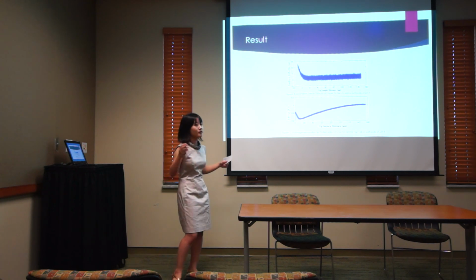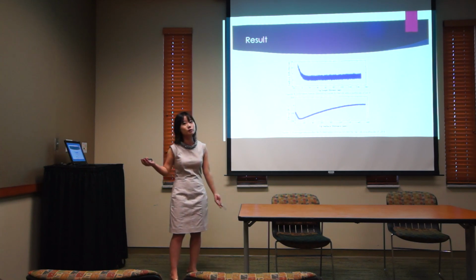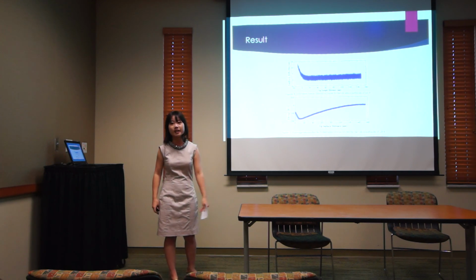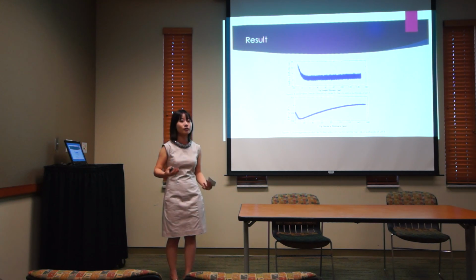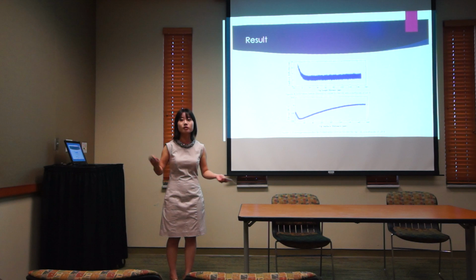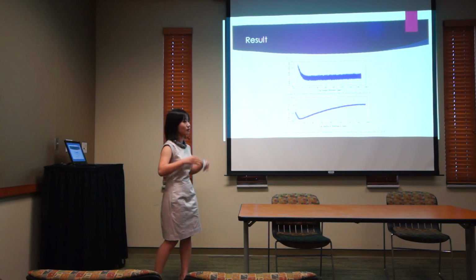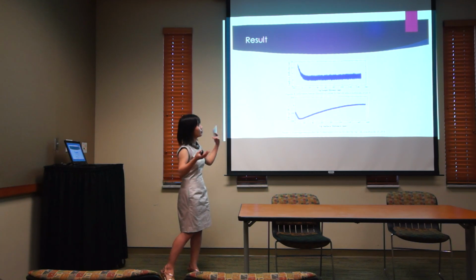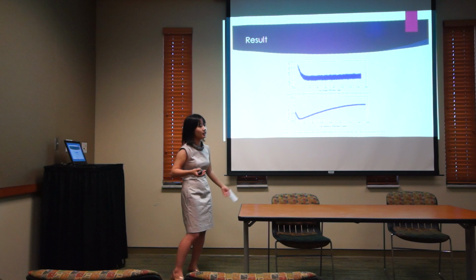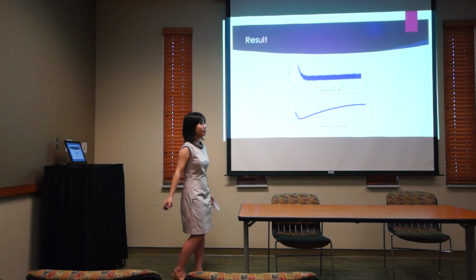Because of the massive amount of calculation we need for each force curve, because we have, let's say, millions of data points for each AFM curve, we need to incorporate all the calculations, the Boltzmann distribution equation as well as the Brownian force reconstruction, into a MATLAB code. So we can just put the AFM data into the MATLAB code, and it will return a complete intermolecular profile.